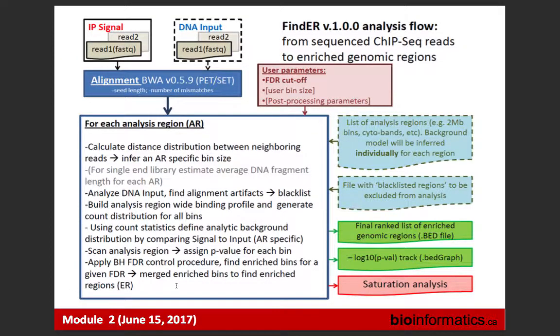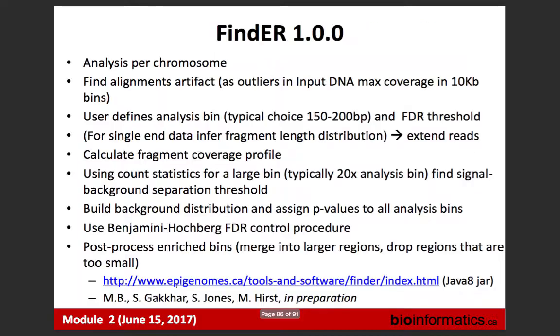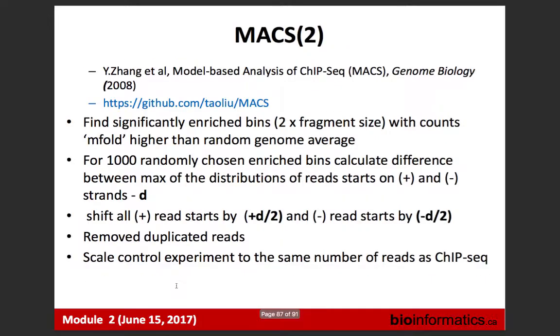I'm talking about peak callers. This is a tool which we are developing, which is called Finder. Maybe we talk a little bit more about it in the practicum. I think my time is up, so I have to finish soon. Some details on Finder: this is version 1. Now we have version 2, which we are hoping to finish soon and publish.